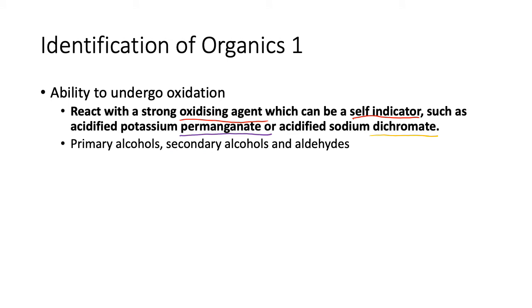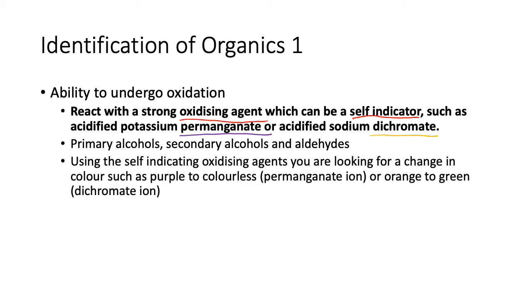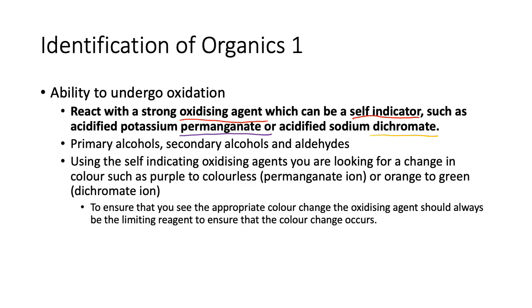Okay, this will oxidize primary alcohols, secondary alcohols, and aldehydes. So if you need to separate out those from others, you can via the ability to oxidize. Okay, change of colors, that's what we said. Ensure that you see the appropriate color change. The oxidizing agent should always be the limiting reagent to ensure the color change occurs.